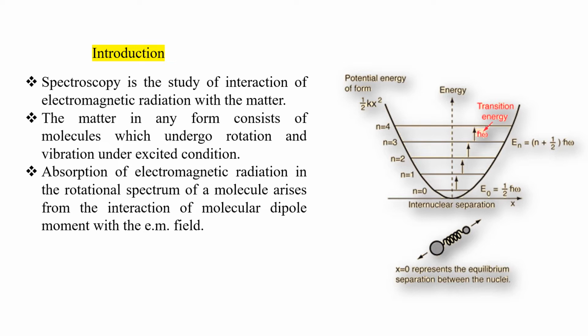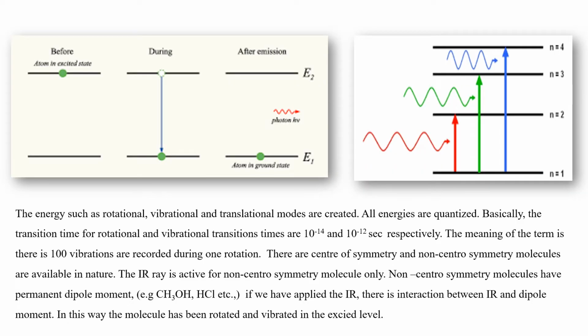That vibration is uniformly distributed over the energy levels, like a harmonic oscillator. From one electronic level to another, there are many electronic levels that take place during the rotations of the molecules. So these are the basic ideas.